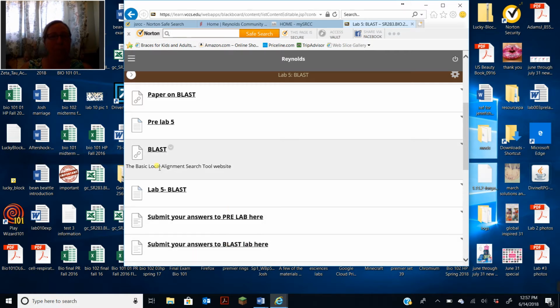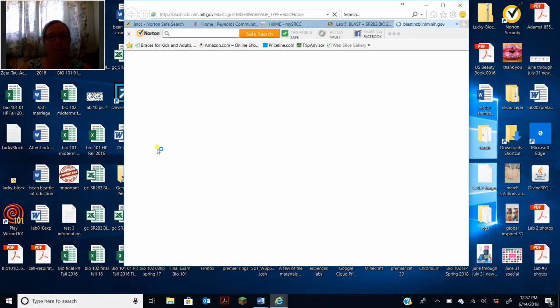Okay. So I'm going to go to the BLAST website, and BLAST stands for Basic Local Alignment Search Tool website, okay? And so I'm going to go there.